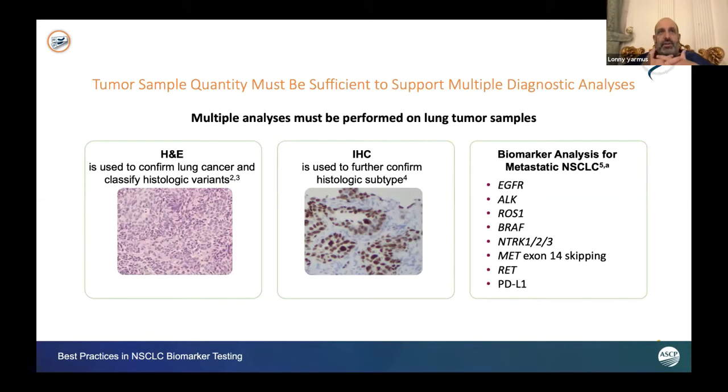And the education and communication lines to ensure that happens is incredibly important. In the pathology realm, you folks all know this, but on the diagnostic end, it's not necessarily well known throughout. So educational efforts like this are incredibly important, as are multidisciplinary conversations throughout your own institutions to educate proceduralists, surgeons, interventional pulmonologists, and radiologists that these tests are needed and should be ordered, and understanding that there are multiple pathways that are needed for these samples.